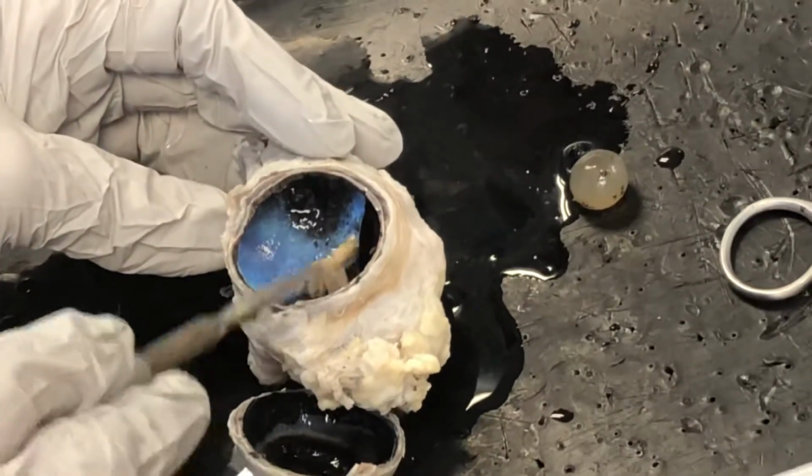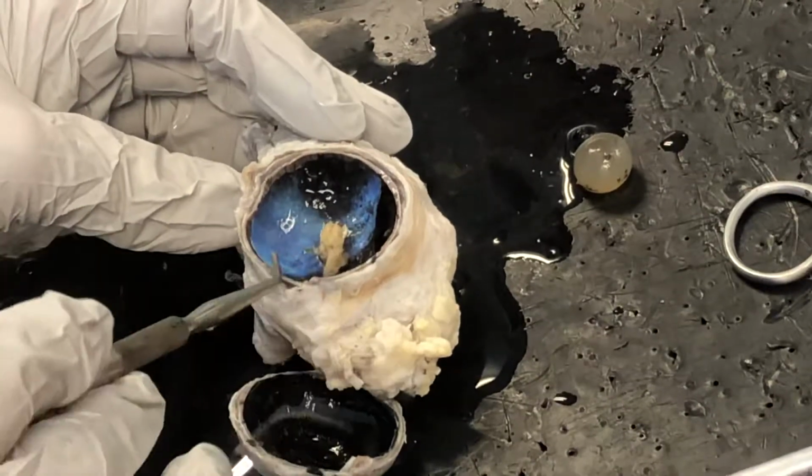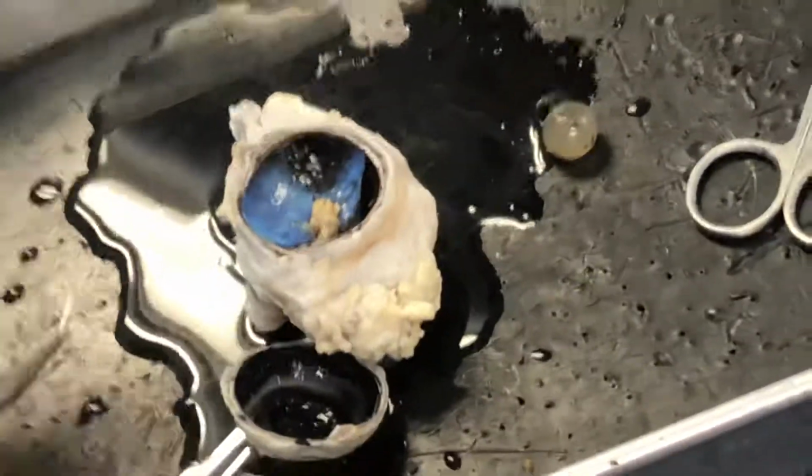And here we see where all the rods and cones are, the snotty looking stuff, all the rods and cones. And then leaving at the optic nerve or optic disc right there. That's it. Any questions? Anything else?